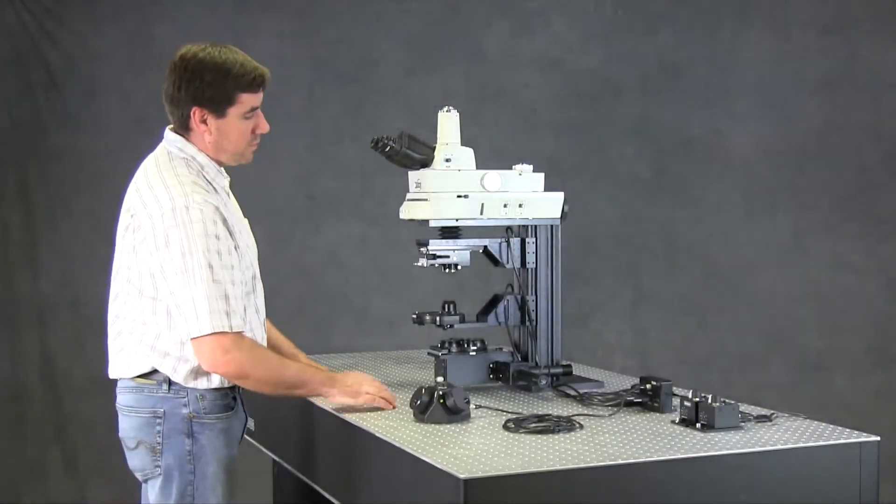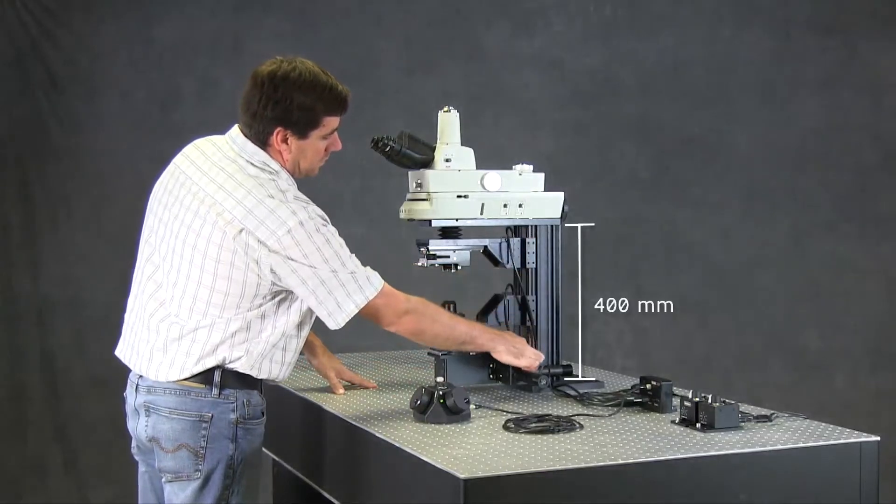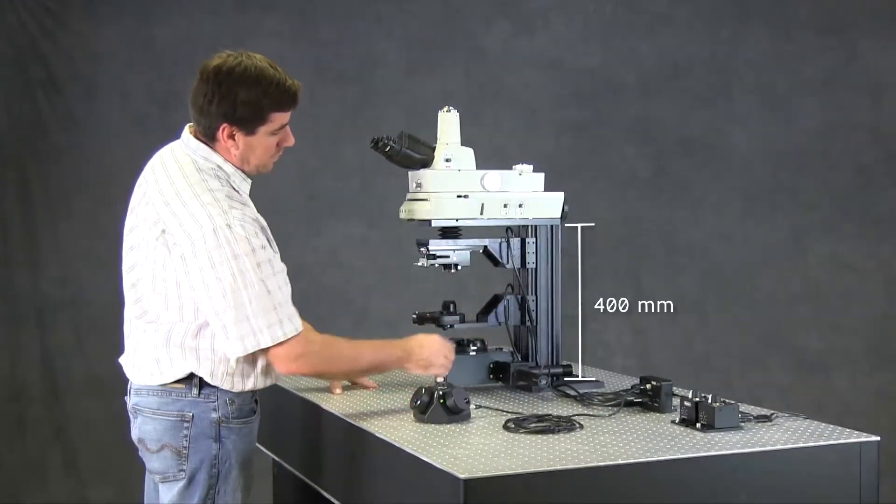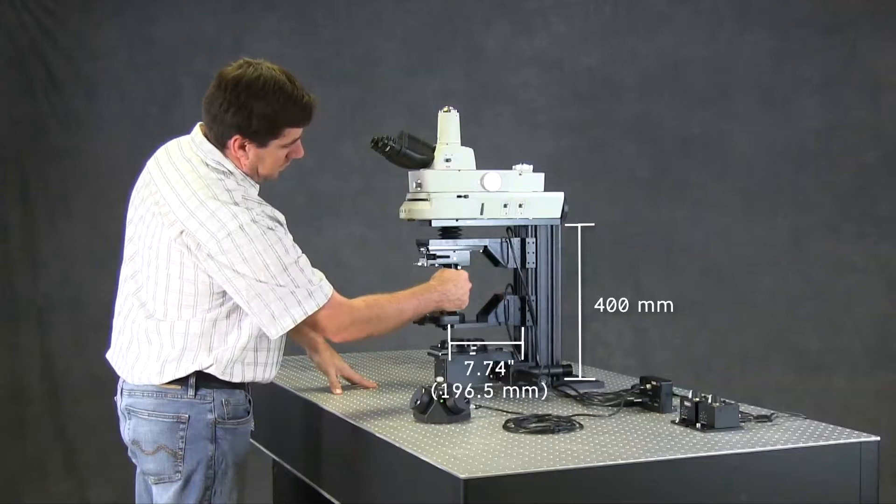We have outfitted this microscope with a 400 millimeter tall microscope body, and like all CERNA microscopes, it features a 7.74 inch throat depth.